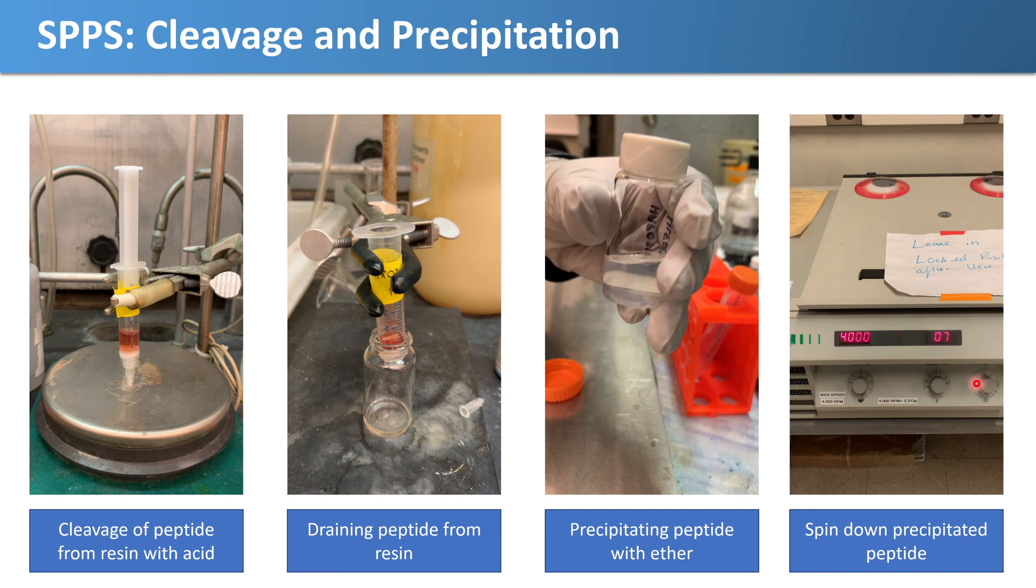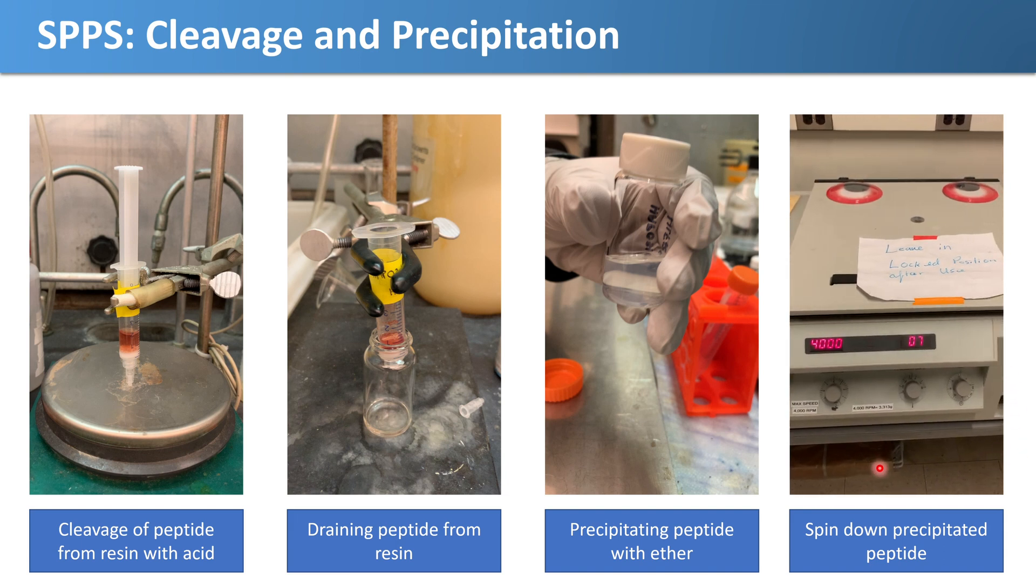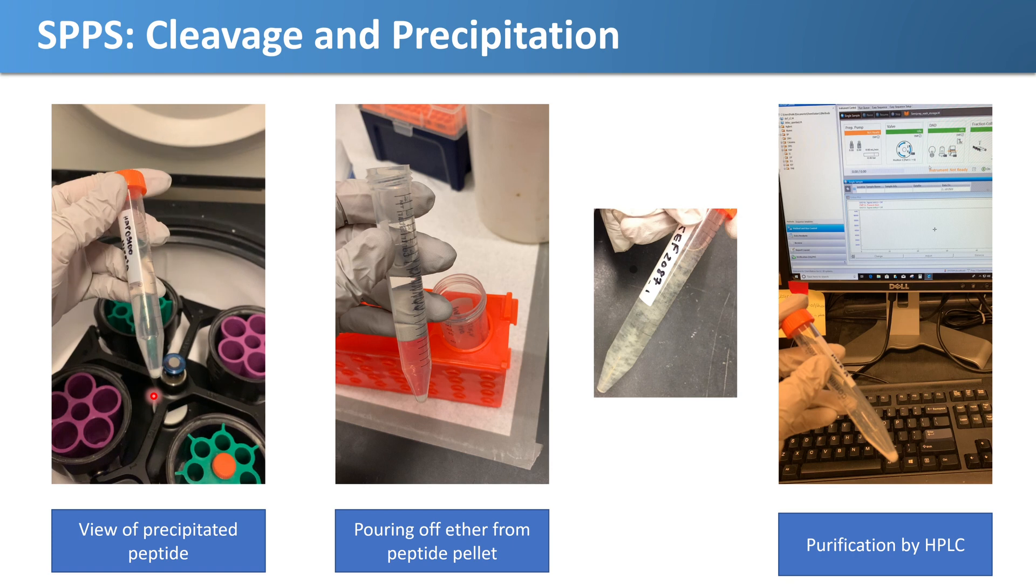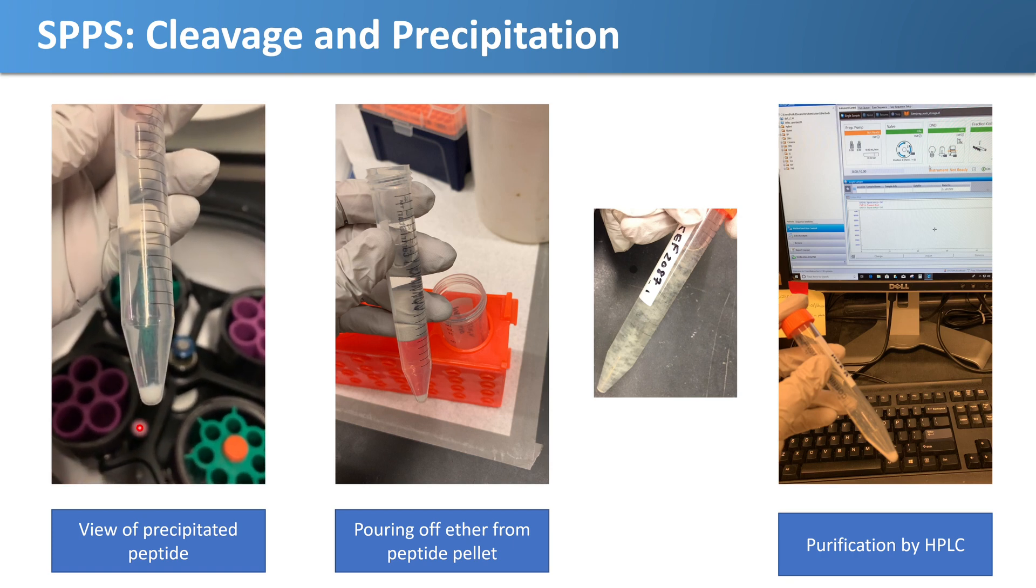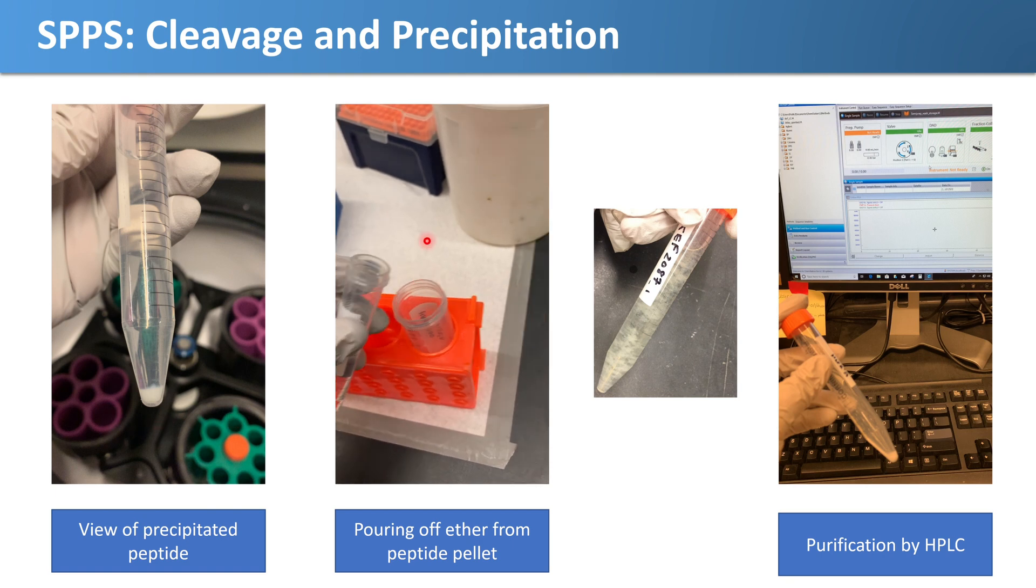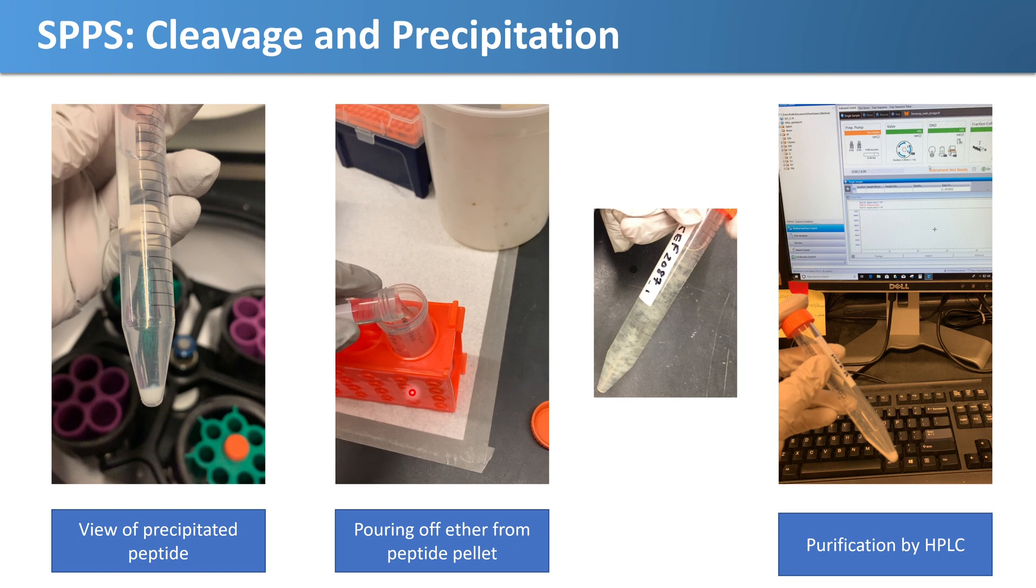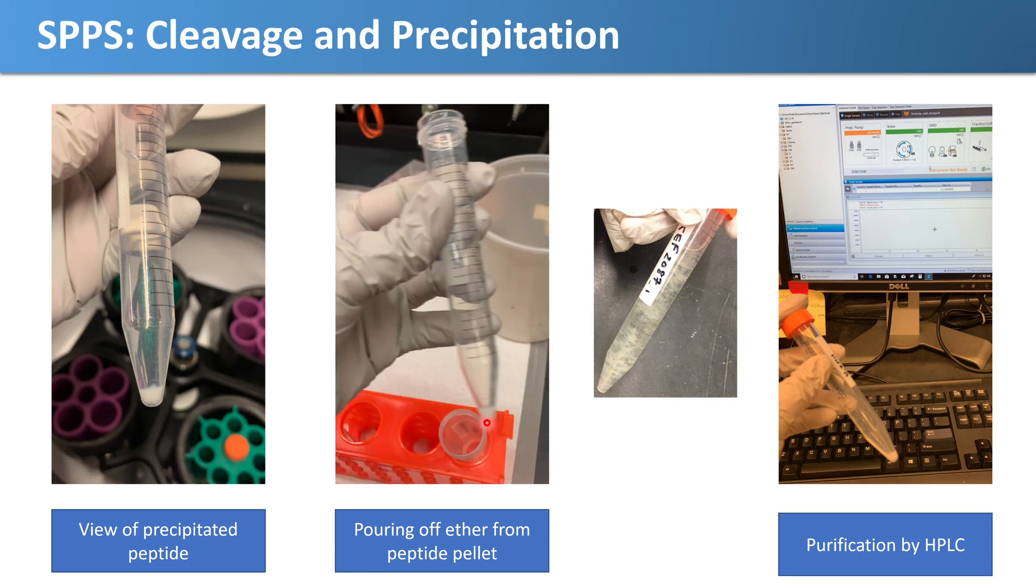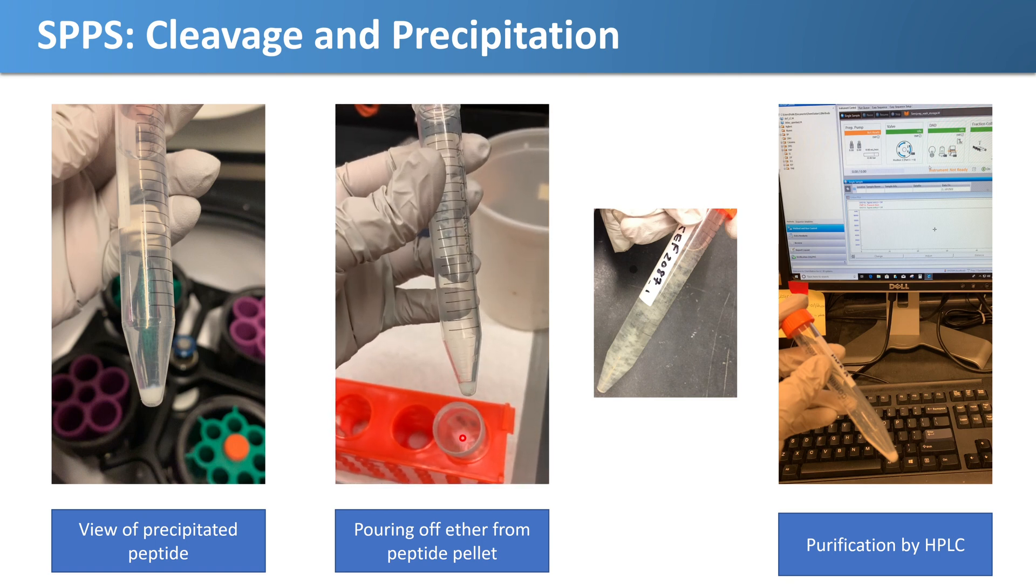To isolate our peptide, we spin it down in a centrifuge. This is after centrifuging it, and you can see there is our pellet, there is our peptide. If you pour off the ether, you can isolate our desired peptide. This is actually from another peptide synthesis that I did. It was on a little bit of a bigger scale, so you can really see the precipitated peptide when it's in the ether.